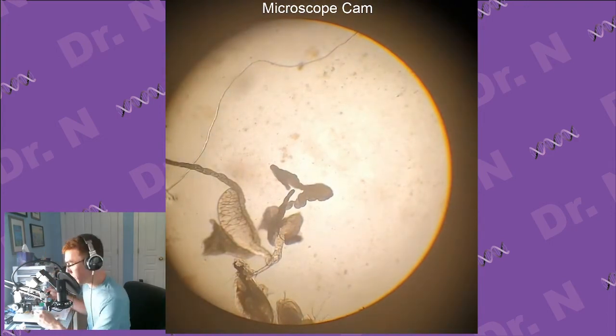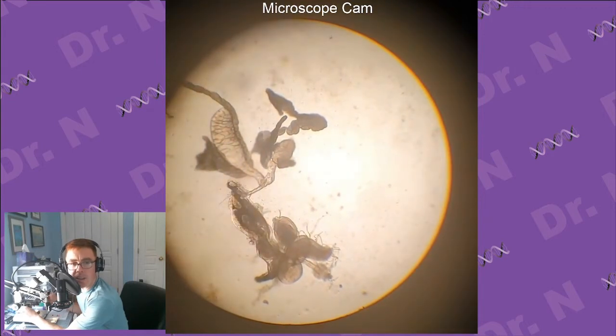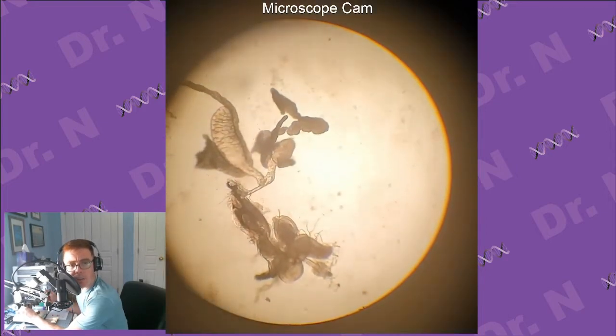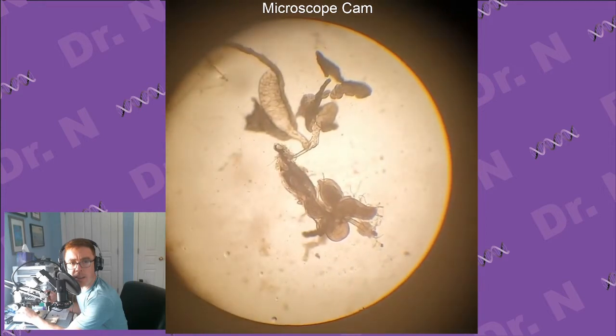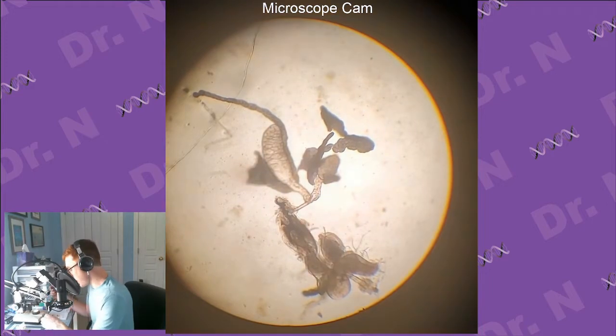So that's it. Looks like we have a brain still attached. Yeah, you can see one of the two spheres at the bottom and the cylindrical part too. Oh, and mouth hooks. So part of its mouth right there, dead center. So that's how it eats. Okay, I'm going to pick this up and put it on a new slide though.